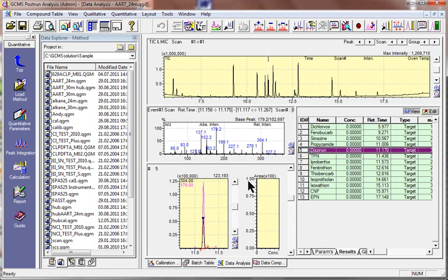So this is how to update a method retention time by using the aart function. The aart function also updates MS parameters, as indicated in the window where we modify the retention time.